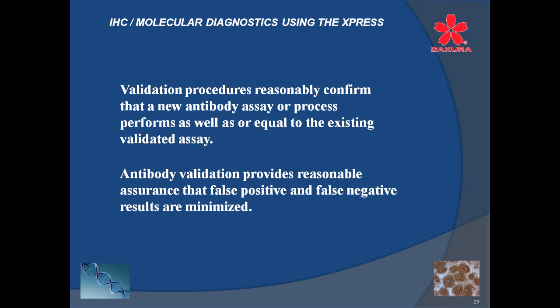Validation procedures reasonably confirm that a new antibody, assay, or process performs as well as or equal to the existing validated assay. So if you've been processing everything on the VIP and you want to switch to the Xpress, you do the validations, and there are probably several ways of doing that, as I've just described one I'm familiar with.